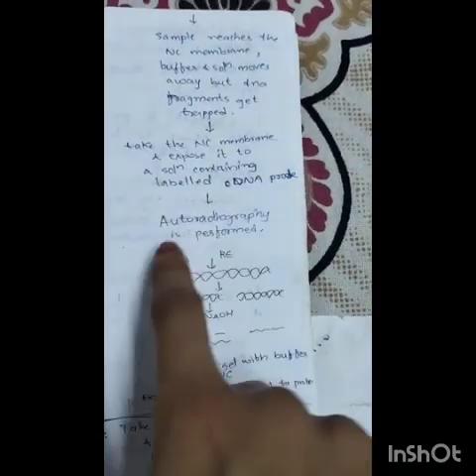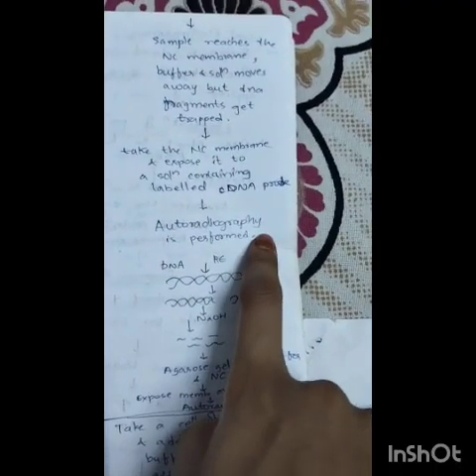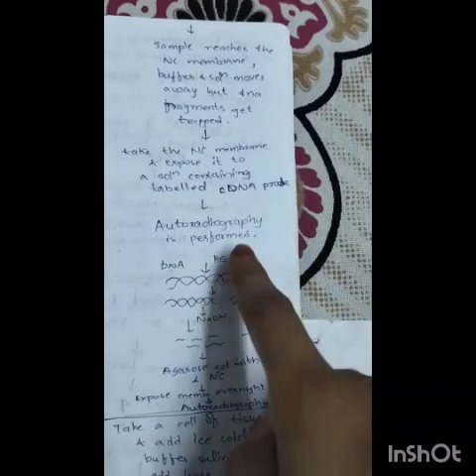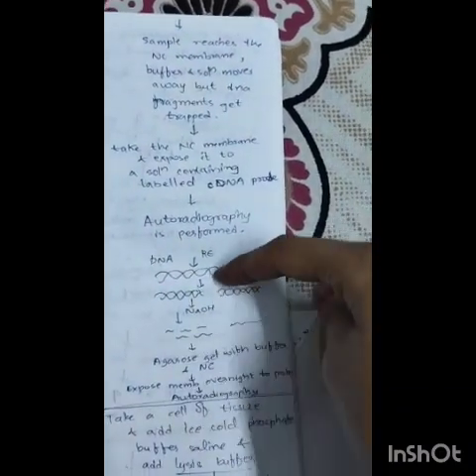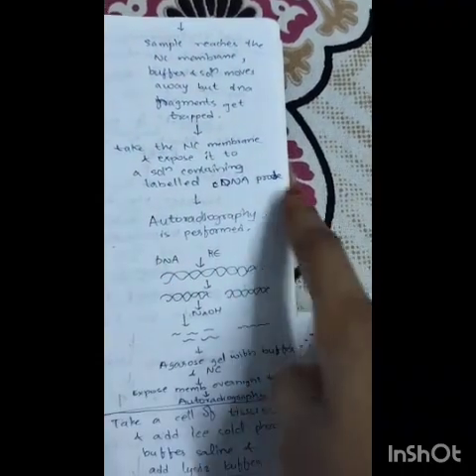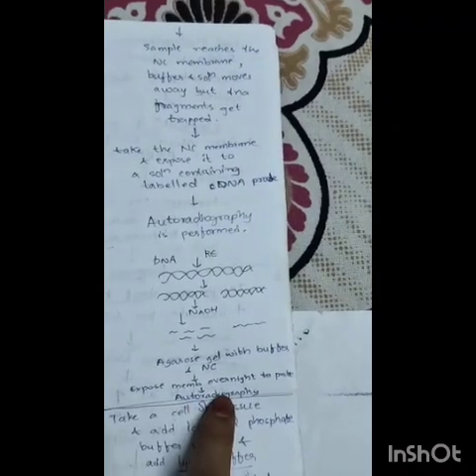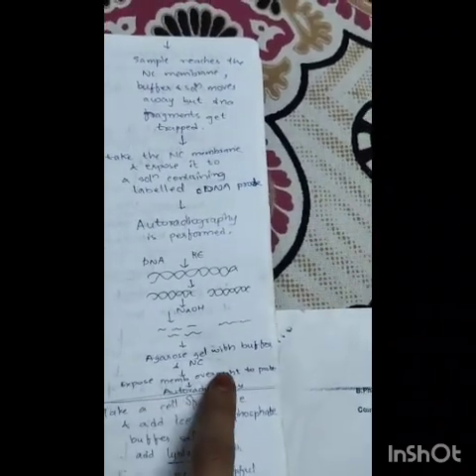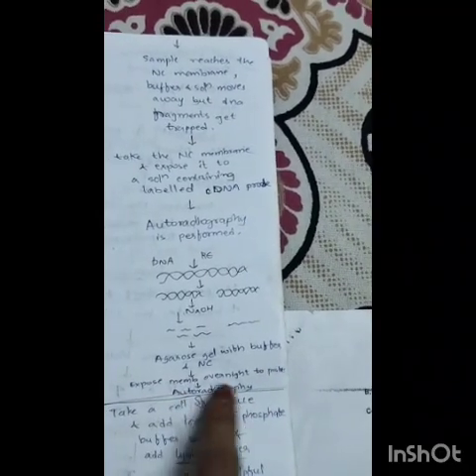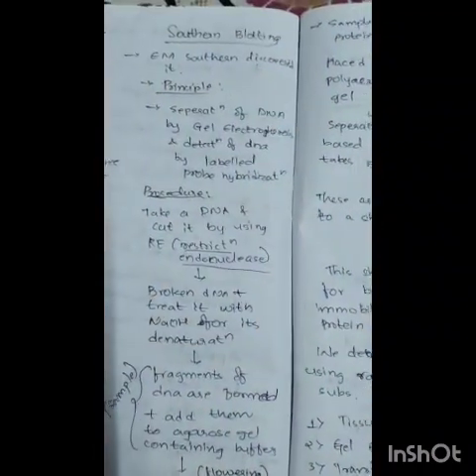First, on a filter paper, the sample is placed and above it the nitrocellulose solid matrix is placed, and above it again 2-3 filter papers are placed. In the sample, the solution moves upwards, but the fragments get trapped in the nitrocellulose membrane. Then this nitrocellulose membrane is exposed overnight to a cDNA probe, and then autoradiography is performed for the detection. This is the procedure involved in Southern blotting.